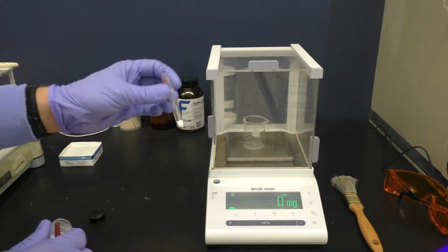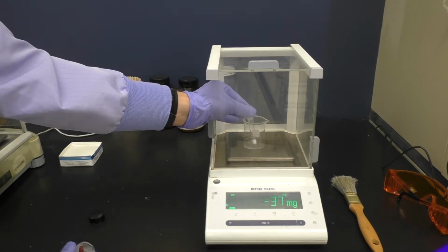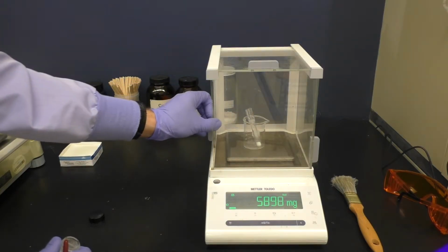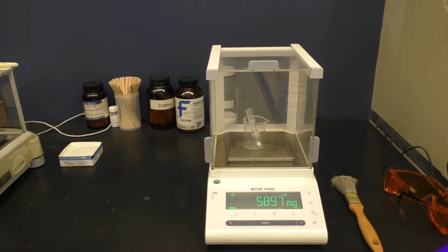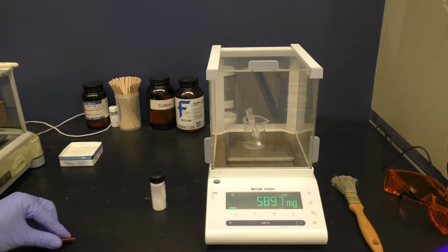So there I've got about that much. Let's figure out the mass for my initial material. So now we should be able to calculate the initial mass of my unknown. And I'm now all set to proceed to the recrystallization setup.